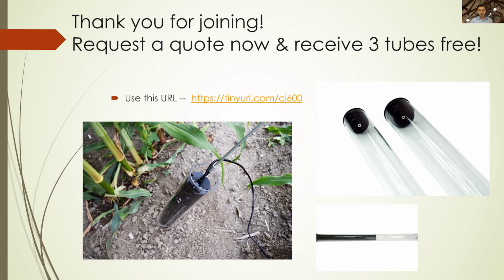What is the recommended DPI for studying root hair and mycorrhizae? Ooh, 600, 1200. I've seen, because the CI-600 does go down to 600 or 900, I would say keep around there for larger colonies, but yeah, I would definitely look into using the 1200 DPI just so you can get as good a resolution as possible in your studies.